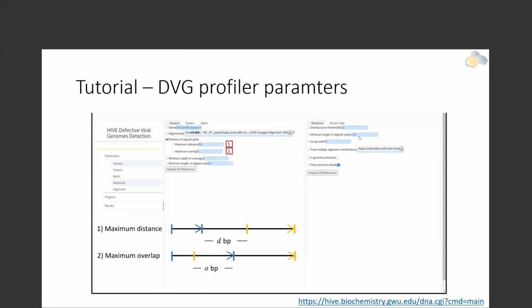And there is also the mapping against the subject, how much of the subject you want to align to, because you don't want to have an alignment against the same genome twice, for example, if you're not interested in snapback DVGs. And the grouping, which is required for a later stage, because due to the evolution of even DVGs, you might not get accurate, stable junction calls, even though we're trying to call these positions in a stable way.